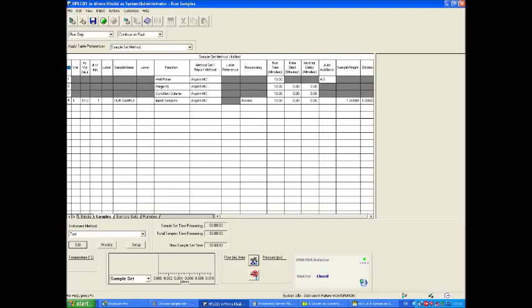The final function carried out before injecting the samples is the condition column. This is used to prepare the column for the experiment. When a column is connected for the first time or after it has been stored for a long time, it needs to be washed with the storage solvent to get wetted. The solvent should be allowed to elute freely for 10 minutes to release possible dust particles, any residue that may be present, or even air. After these functions are carried out, the sample can be injected into the system.